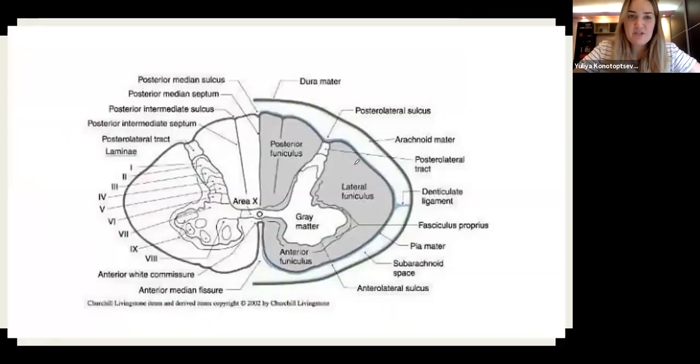Okay, now we're starting the bad thing. It's a bit out of focus, so hopefully you can see what's happening here.